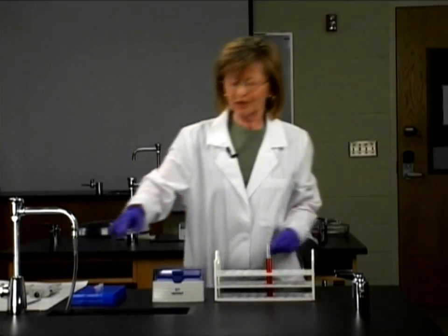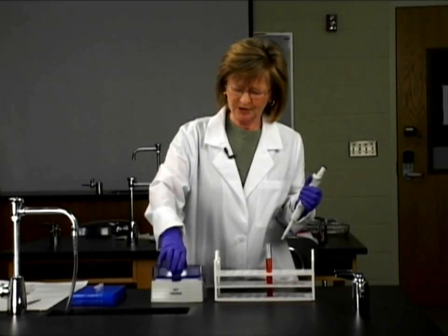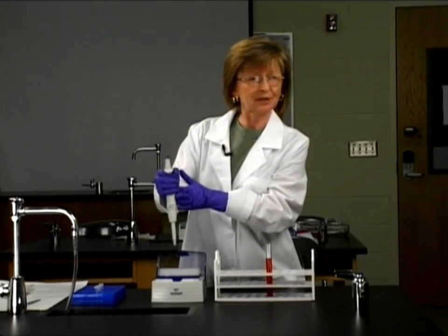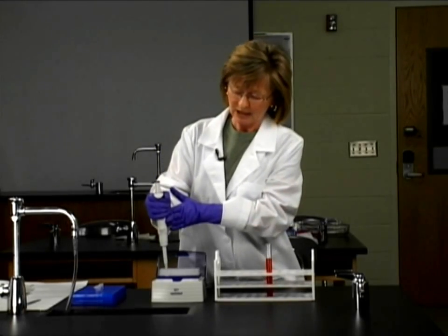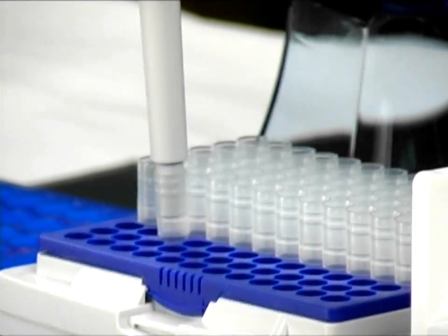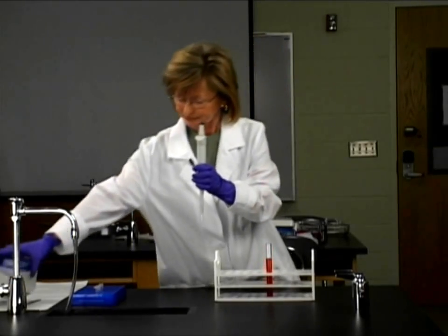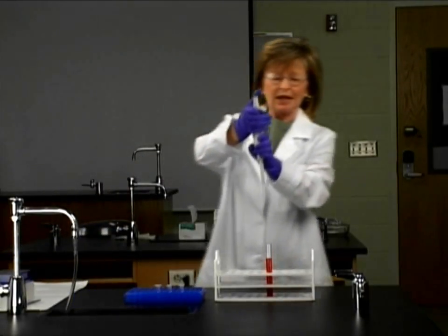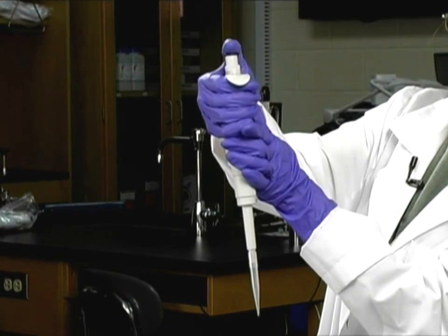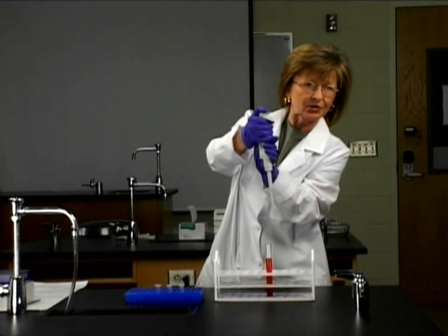So how do we use one of these micropipets? The first thing that I'm going to do is set the micropipet tip onto the micropipet. I'm going to press down firmly but gently, and lift straight up. And now you have to expel the air from the barrel of the micropipet before putting it down into the liquid, into the center of the meniscus.